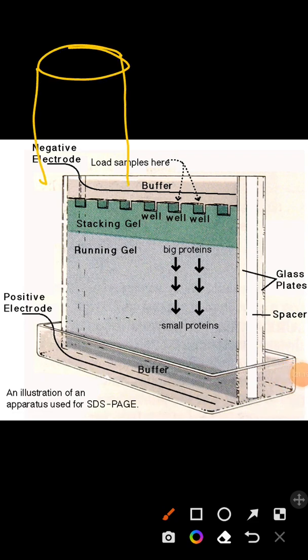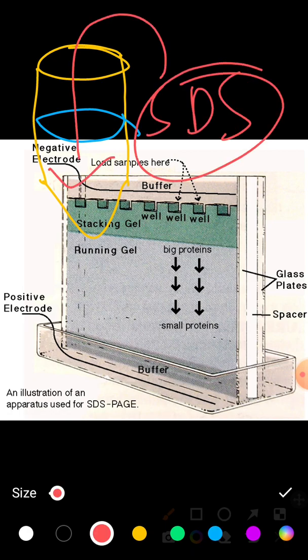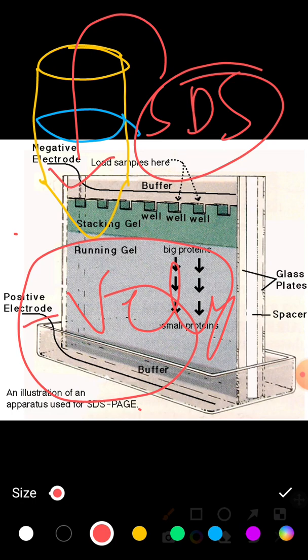Remember, suppose this is an Eppendorf tube where you have your sample. So you have added the SDS. This SDS binds to the protein in amounts roughly on the basis of their molecular weight. One molecule of SDS binds with 2 molecules of amino acid. Okay, and SDS will give a net negative charge to the protein molecule, rendering the intrinsic positive charge of the protein insignificant. Okay, that means all the proteins become net negatively charged. Not only that, it also facilitates the unfolding of the protein partially, okay, such that all the SDS bound proteins become similar in shape.